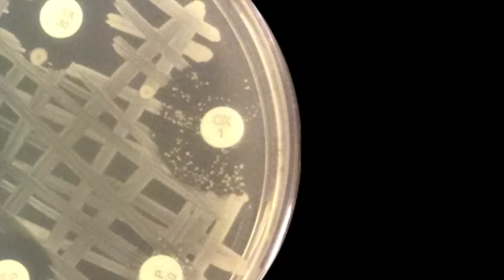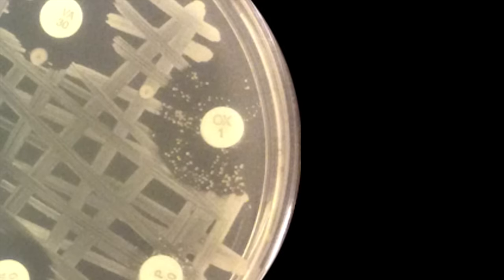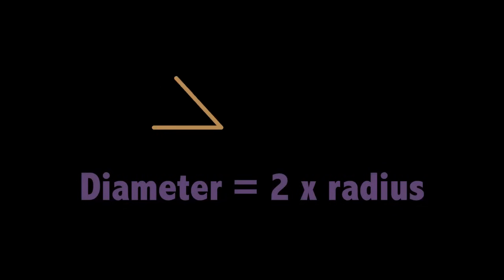Look at this disc. It's too close to the edge to measure the diameter. But can we still get accurate data for this antibiotic? Well, we can measure the radius, take the radius, and double it to get the diameter.